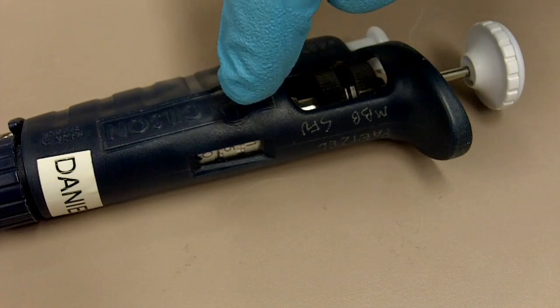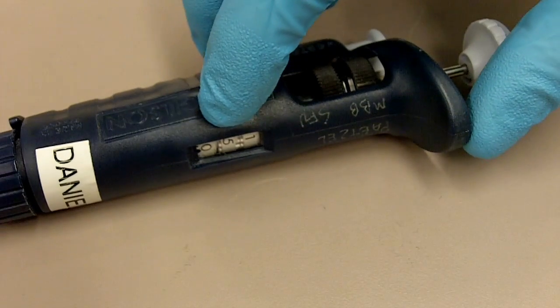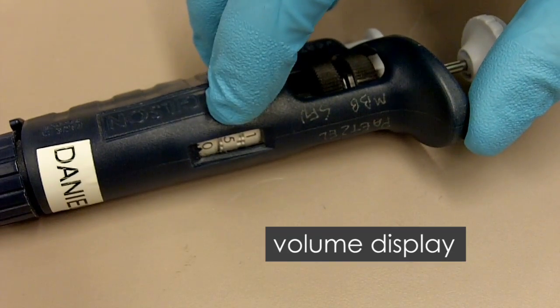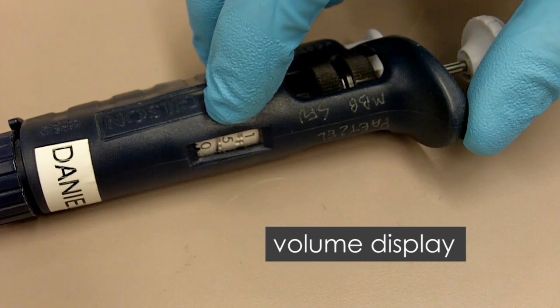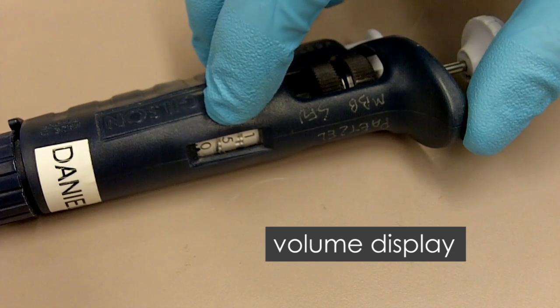So first of all, we'll look at here. Here is the volume display. It displays how much volume this pipette will withdraw at this time.